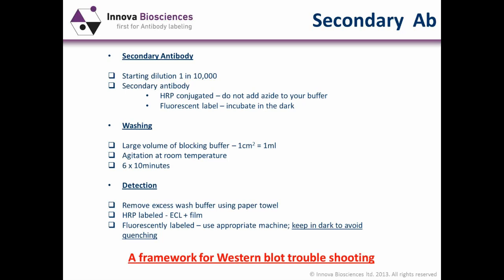So hopefully this has been a benefit to you, and it allows you to really understand, as someone who's spent many years at the bench trying to understand how to optimize a Western blot, that this will provide a framework for you to be able to, like I did in the end, take any antibody and quickly optimize the conditions for probing and for a Western blot experiment.